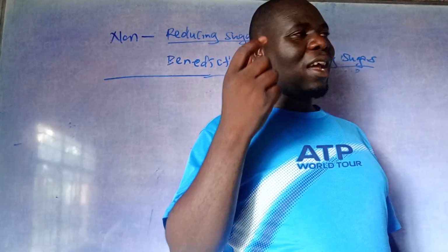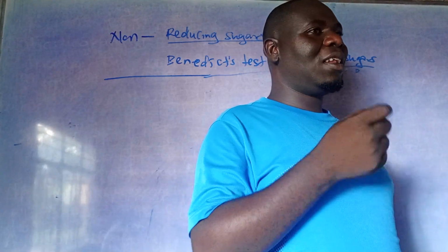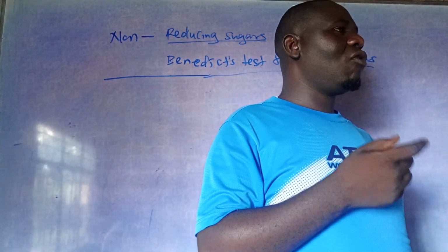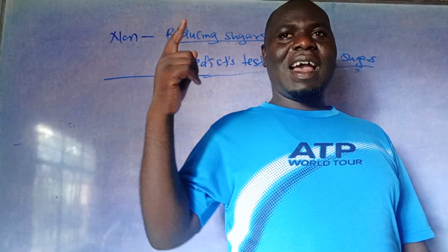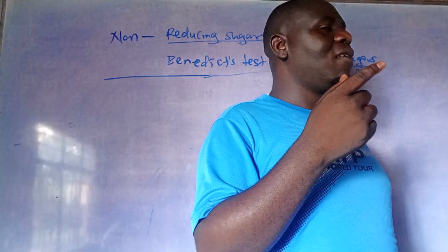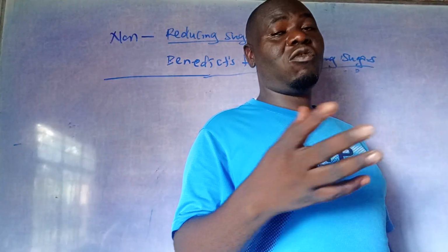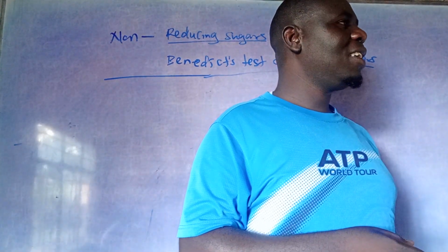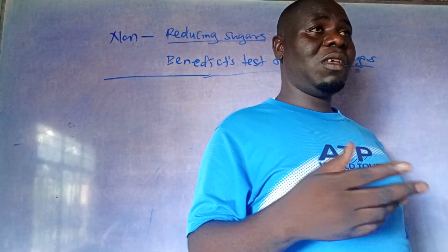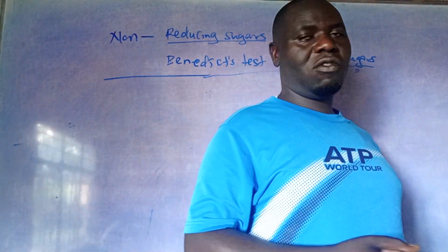So now you get another 2 cm³ of the sample solution, put it into a clean and dry test tube. Then you add 1 cm³ of what? Hydrochloric acid. Then you heat the mixture for 3 minutes. After heating, you allow it to cool. Then you add sodium hydrogen carbonate or sodium hydroxide solution to the mixture, little by little, until the fizzing stops.